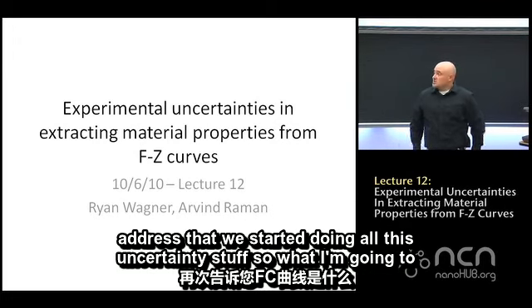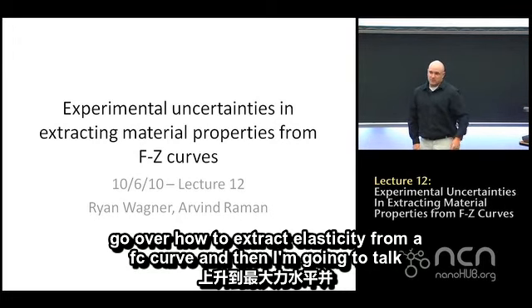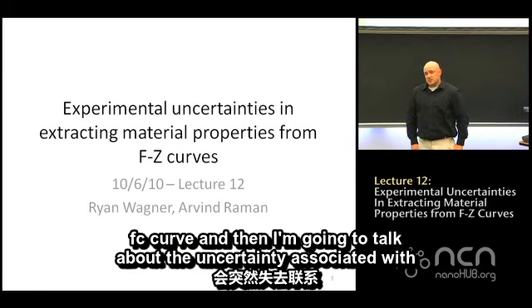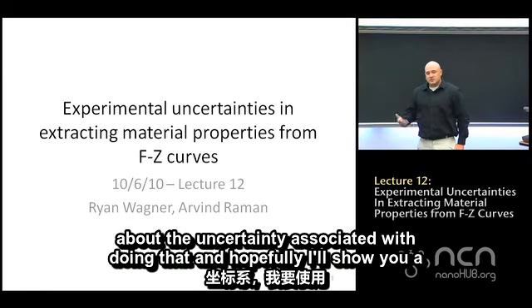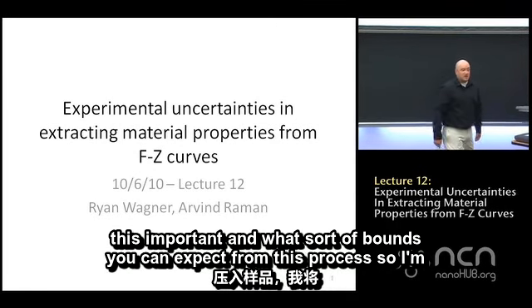So what I'm going to run you through today is to, again, go over how to extract elasticity from an FZ curve. And then I'm going to talk about the uncertainty associated with doing that. And hopefully I'll show you a bit of a case study of some of the work I've done to try to highlight why this is important and what sort of bounds you can expect from this process.